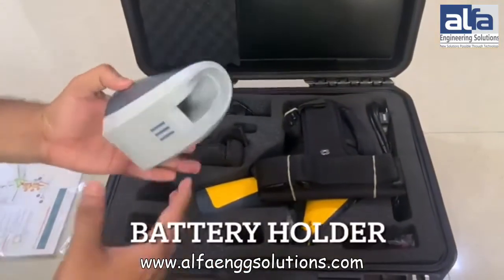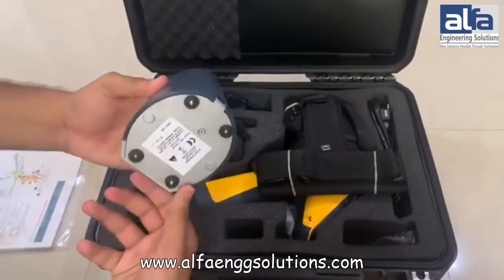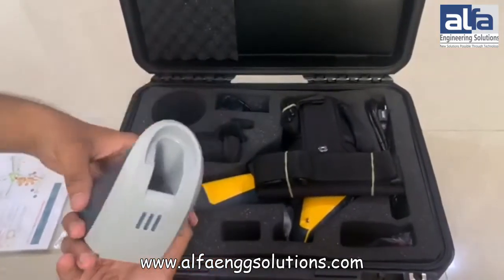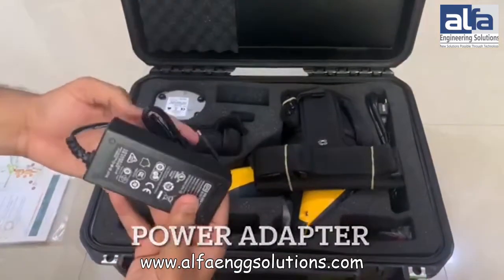This is the battery holder in which we have to place the battery to get it charged up, and we have to connect the power cable to the back side of the holder. This one is the power adapter.